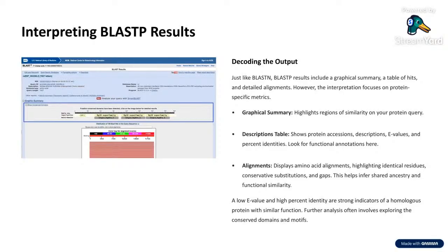First of all, we go to NCBI, then search, and select TBLASTX and paste our nucleotide sequence in FASTA format, then choose a nucleotide database, then click BLAST. It takes some time.